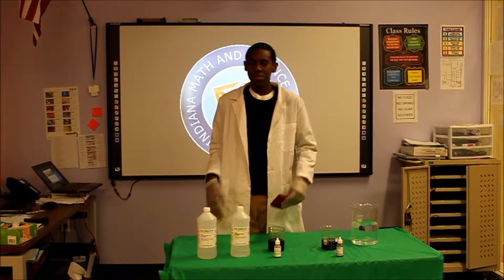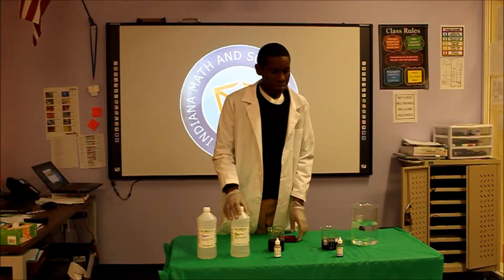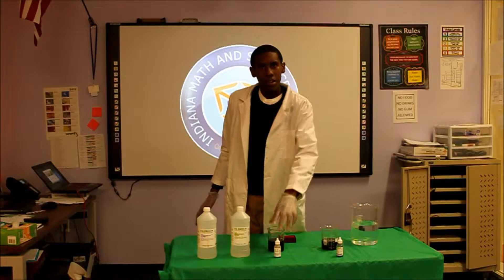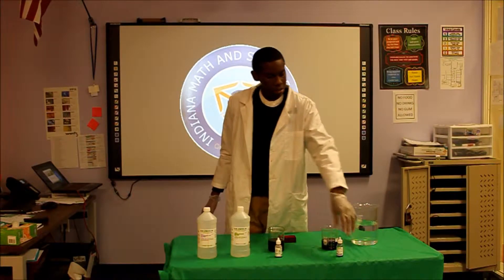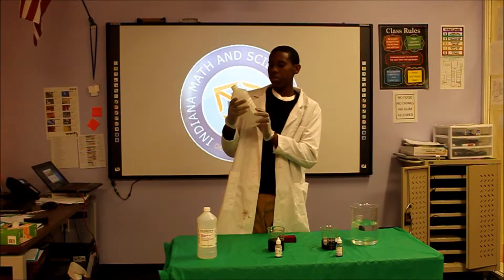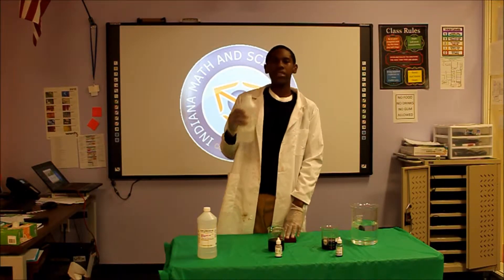Today, we're going to do the Indicator Sponge. My materials I have today are tap water, red food dye, blue food dye, hydrochloric acid, and sodium hydroxide solution.